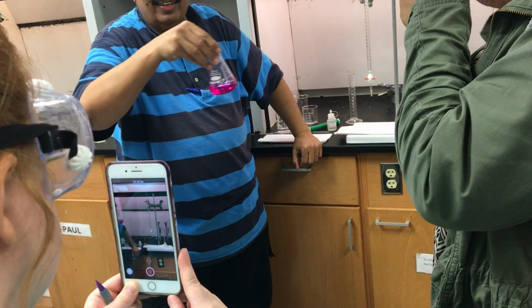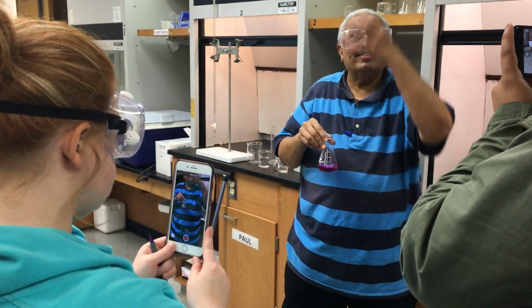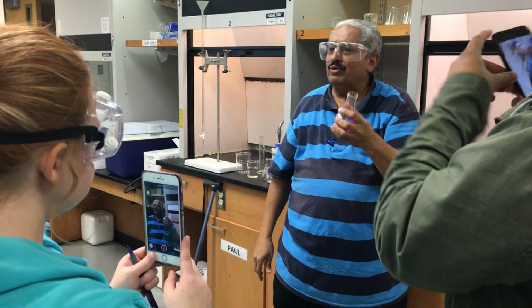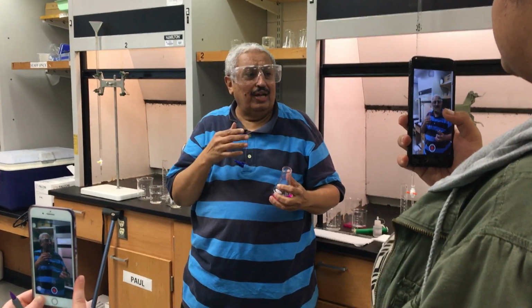Wow. Can I reverse the color? Yes. I have to what? Carbon dioxide from the air or exhale CO2 inside. The pink color will turn off. So, everybody is following now? So, we did very well.